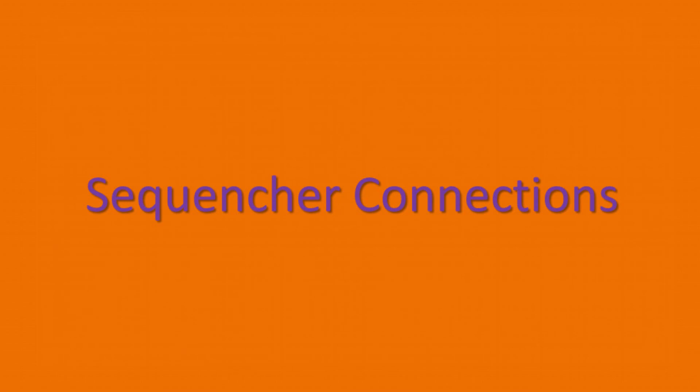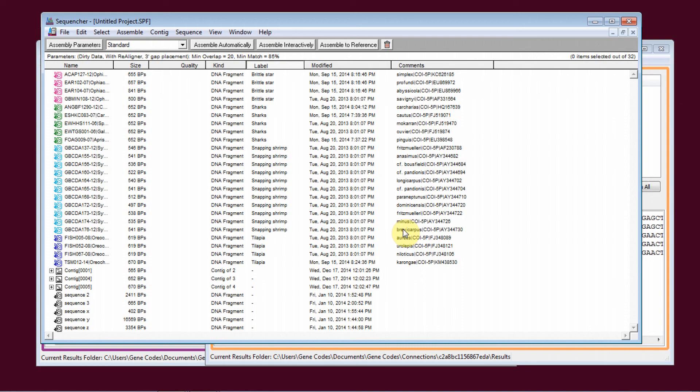Now, I would like to show you Sequencher Connections. Connections was introduced in Sequencher 5.2 and can be used with Sanger or NGS DNA sequence data. Sequencher Connections allows you to simultaneously run multiple analyses on individual sequences or groups of sequences in parallel.